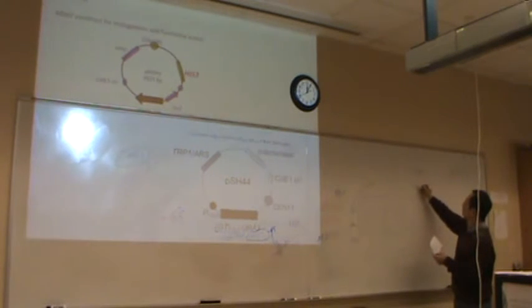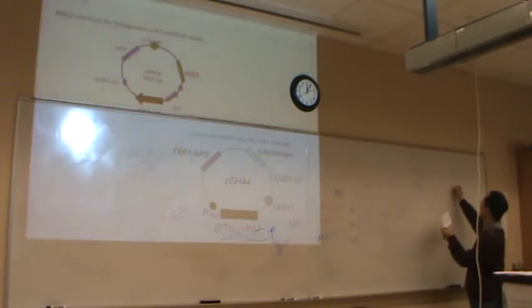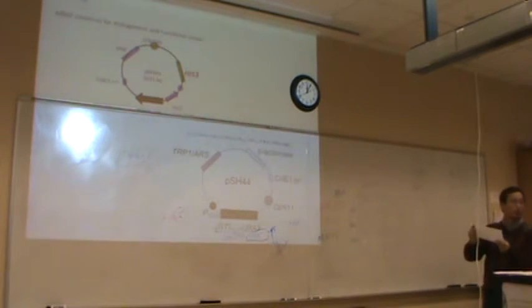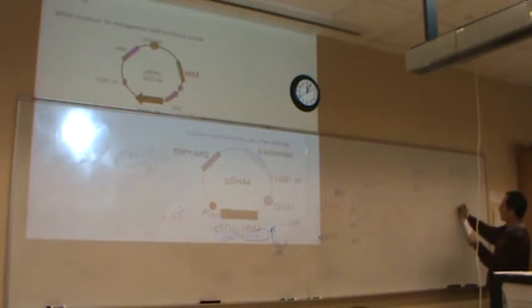Group 2 is D621N. The strain was AG422. D621N, very good. Group 3, AG91, this is G693D. Group 4, H658Y.